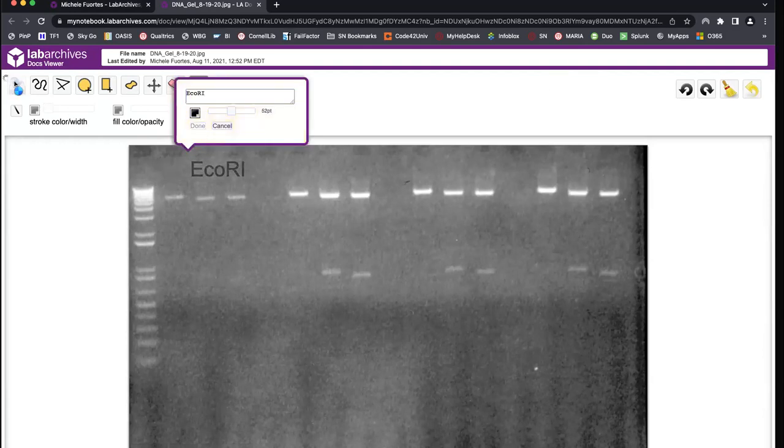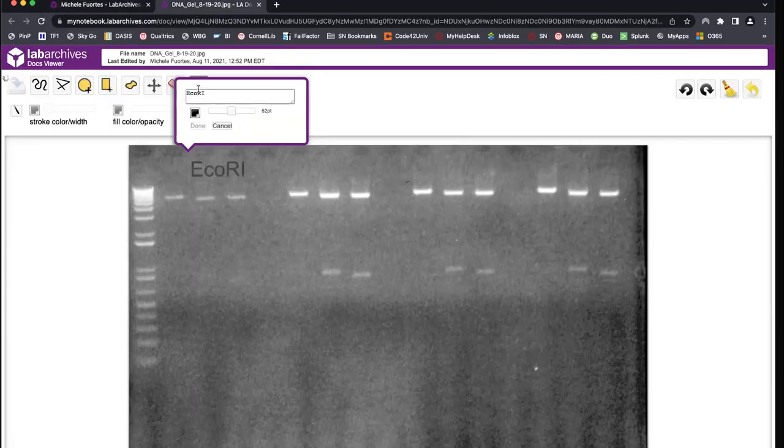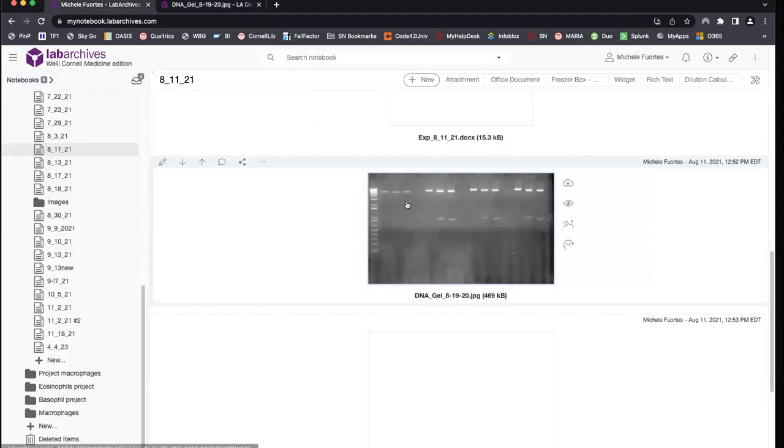I'm going to save it. Very slow today, not sure why. Sorry, but anyway, here it is.